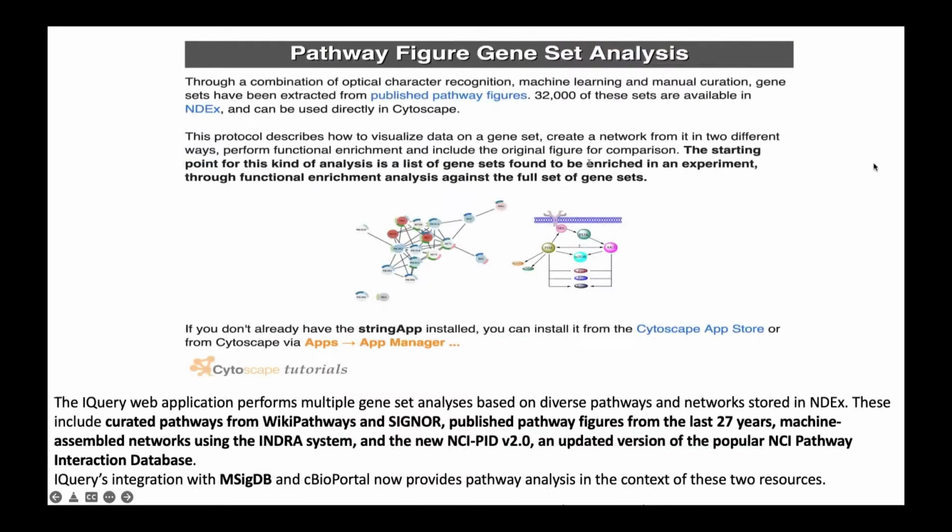And just let me see. This tool is integrated with Cytoscape. Probably many of you know and use Cytoscape. So it's really two great resources combined together. I just wanted to give you an idea how much went already into creating this. And this might be even a little outdated information.